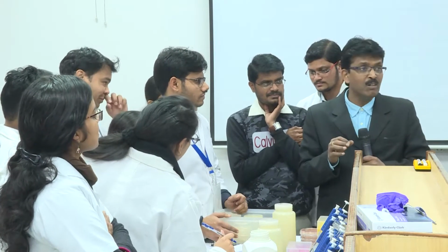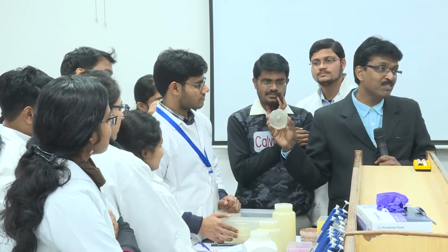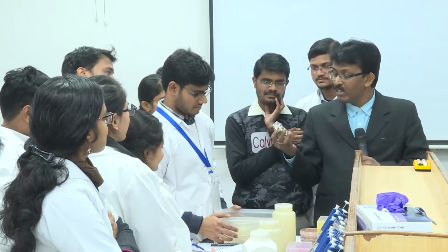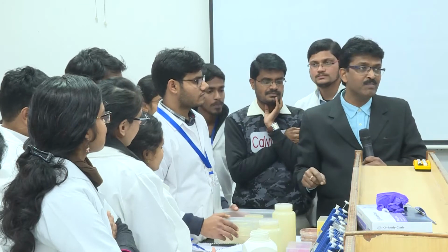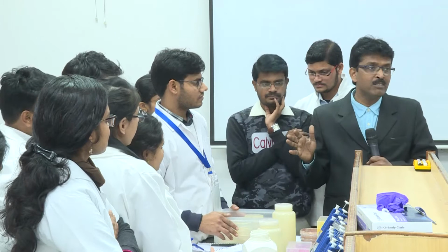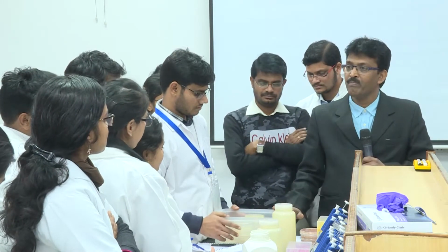All microbiologists and pathologists, what we do most of the time, we prepare food for microorganisms. It's big work all the time, correct? So never ever streak your plate the day of your experiments, right? 24 hours before, you prepare your plates, all right? And keep your plates in a setup like this.